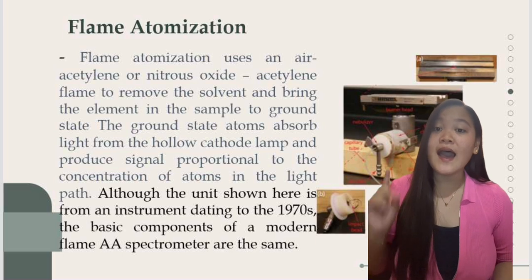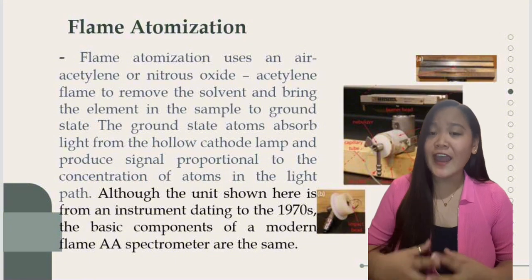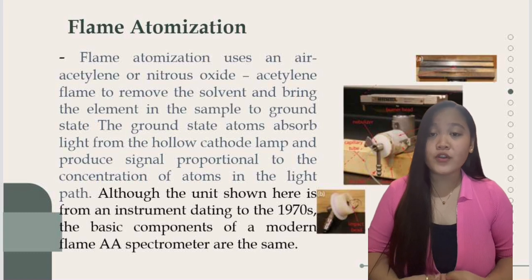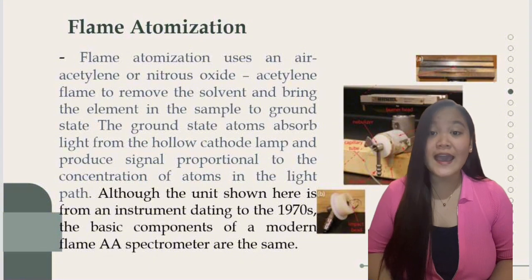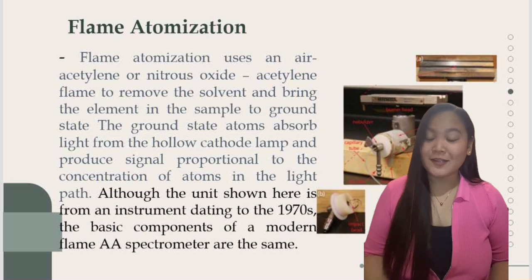First, flame atomization. The sample solution is nebulized, or turned into a fine mist, and mixed with a combustible gas. The mixture is then burned in a flame, which provides the energy for desolvation, volatilization, and dissociation. Okay, so that is flame atomization.